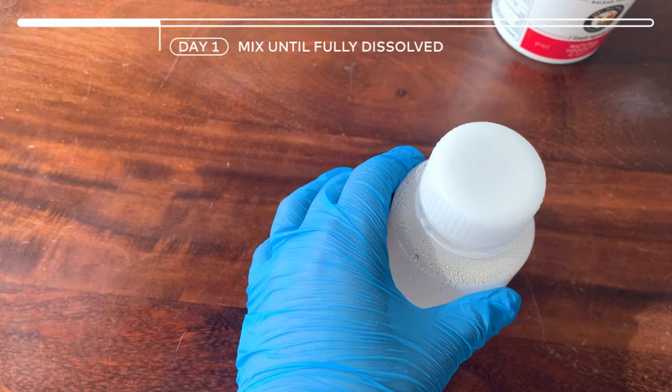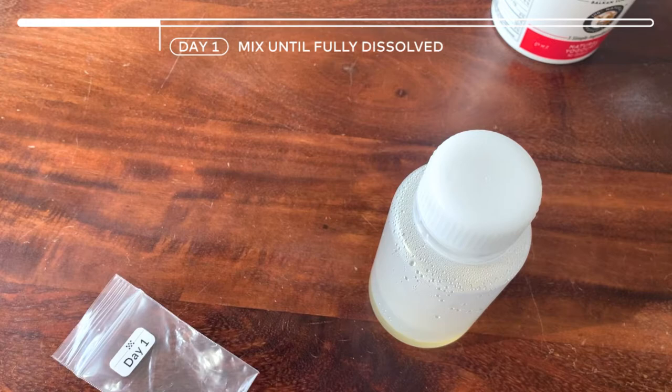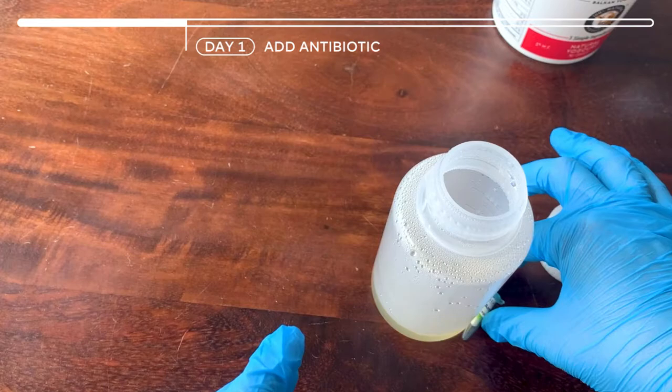Now it's very hot because I can't hold my hands on it for more than 5 seconds without burning, which means it's not ready yet for antibiotics. So give it maybe 15-20 seconds for it to cool down and then you can add the antibiotics. So we can remove the lid and add the antibiotic.